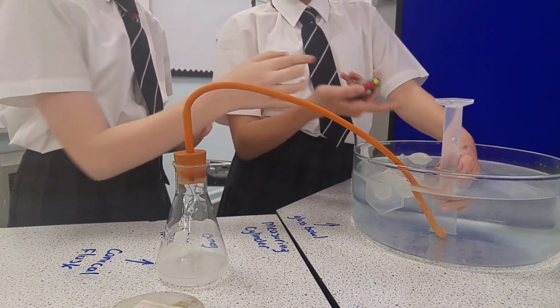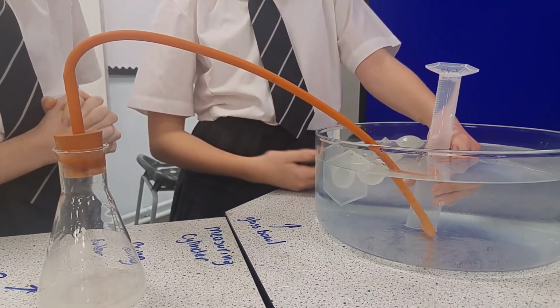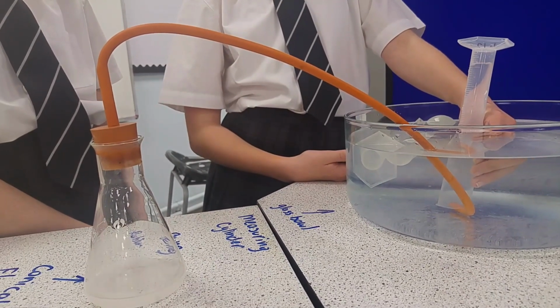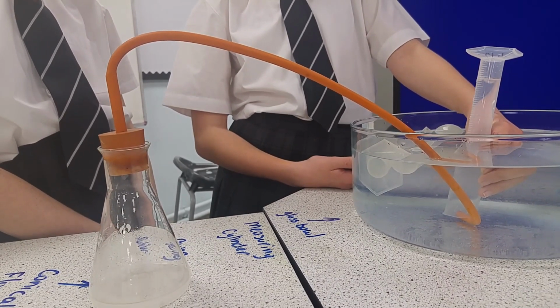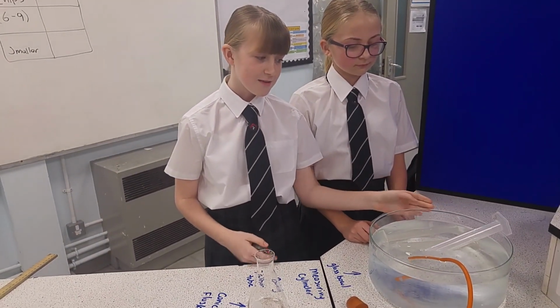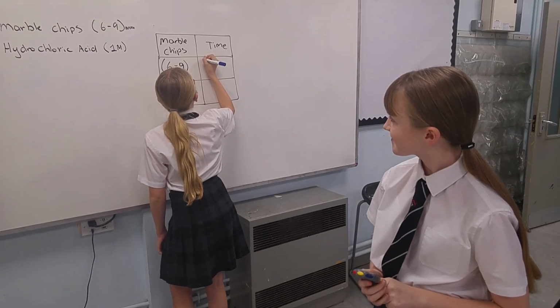Now we're going to time how long it takes for the water to reach 50. Now that the measuring cylinder has emptied, we can see that it took 56.93 seconds. Now I'm going to write it on the table of results.